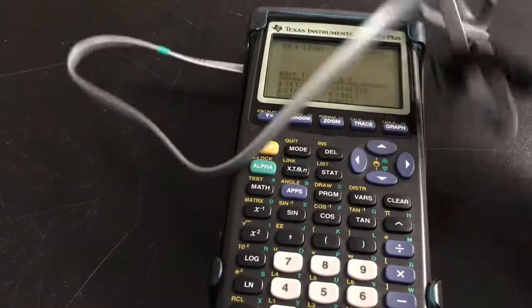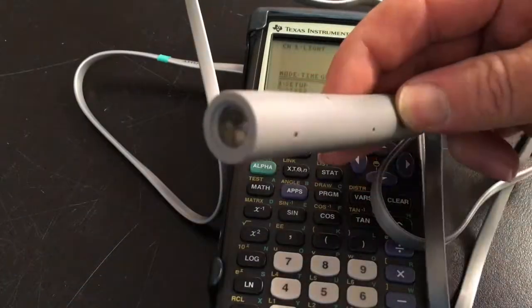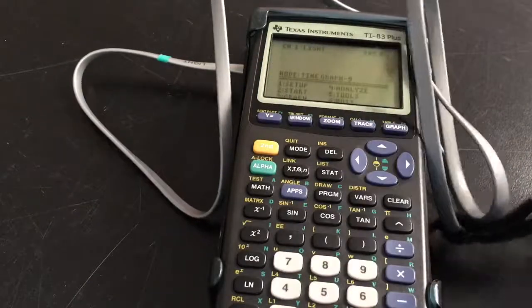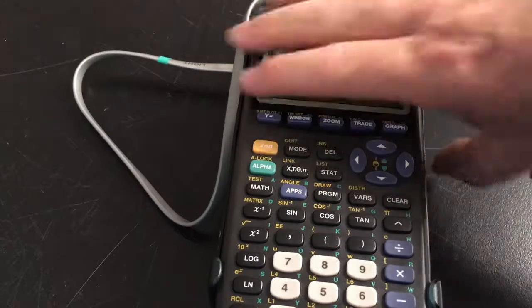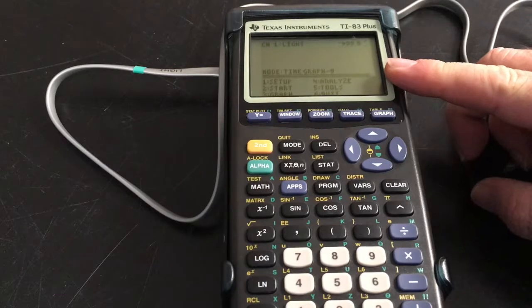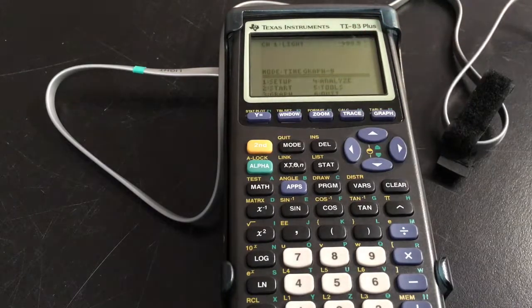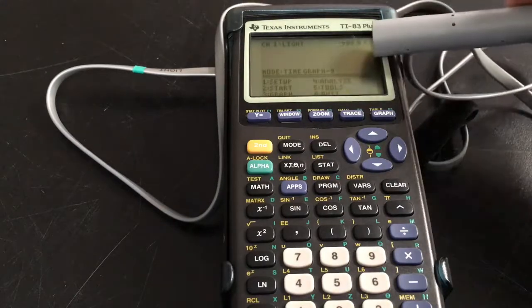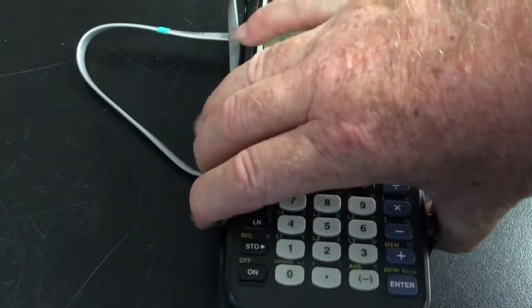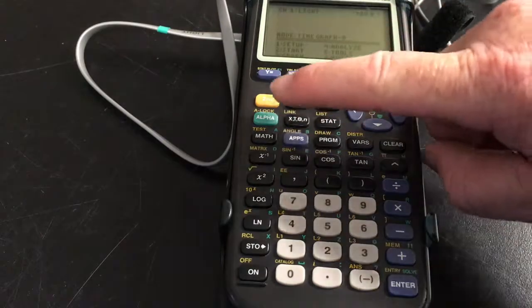And our probe's just got a photocell in the end of it. Okay, and the light goes down that tube and then records a voltage. That voltage gets sent to the data logger underneath here. The data logger then sends the voltage to the computer, and depending on what program and probe is running, will give you a readout for that. This is a false reading, so something's gone wrong in the connection of the two. So we need to reset this computer, and I'll do it so you can just see the screen there.